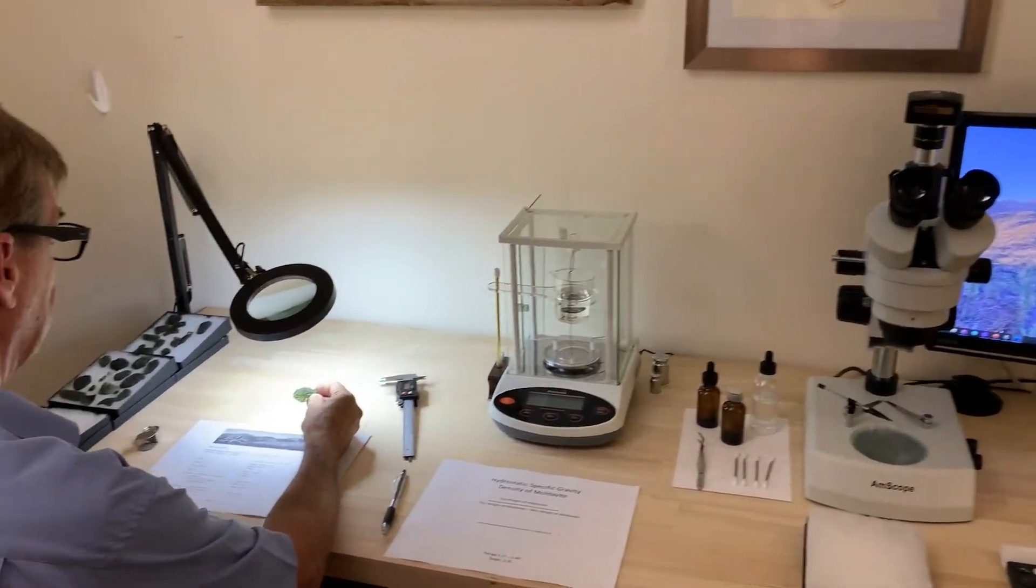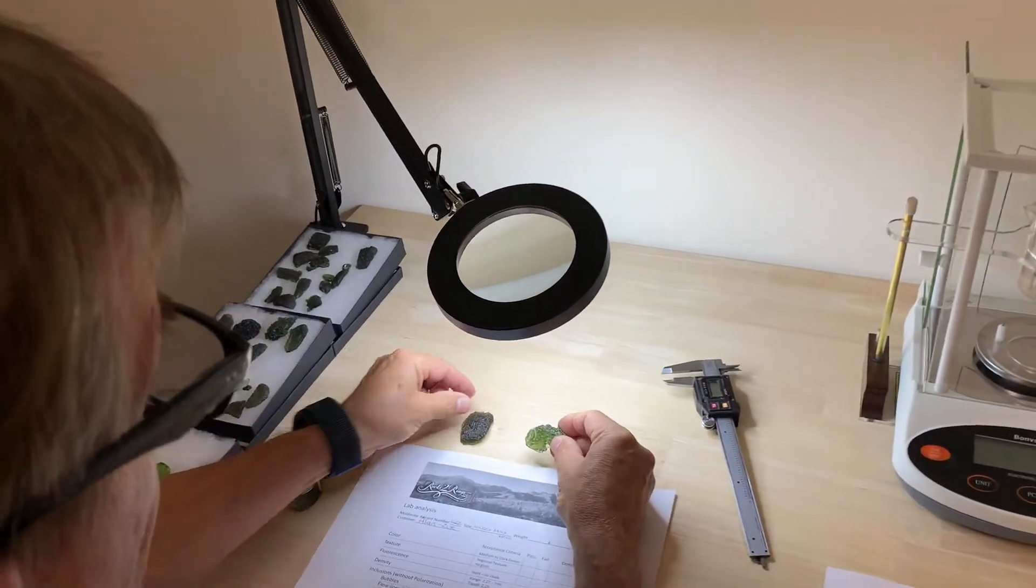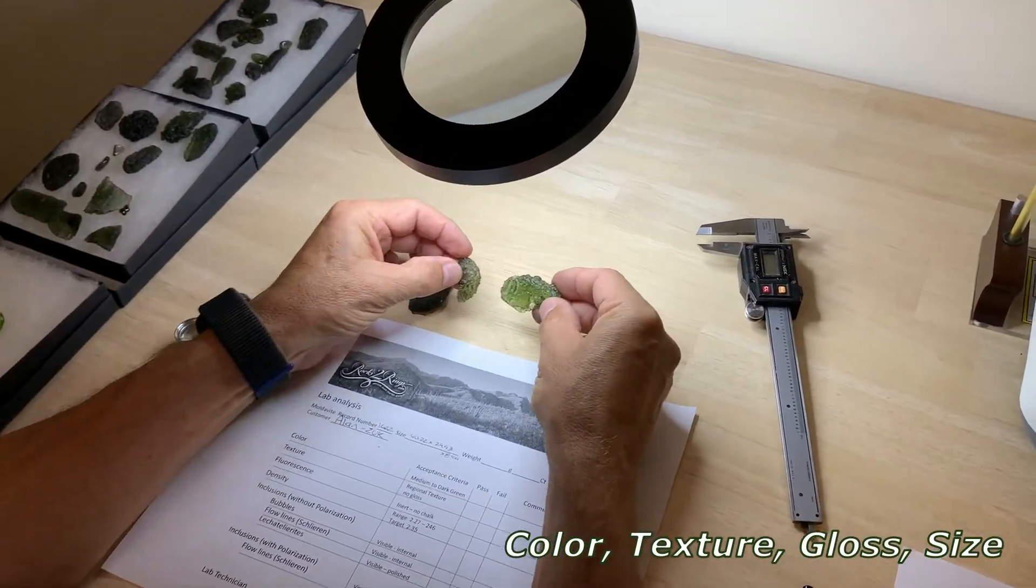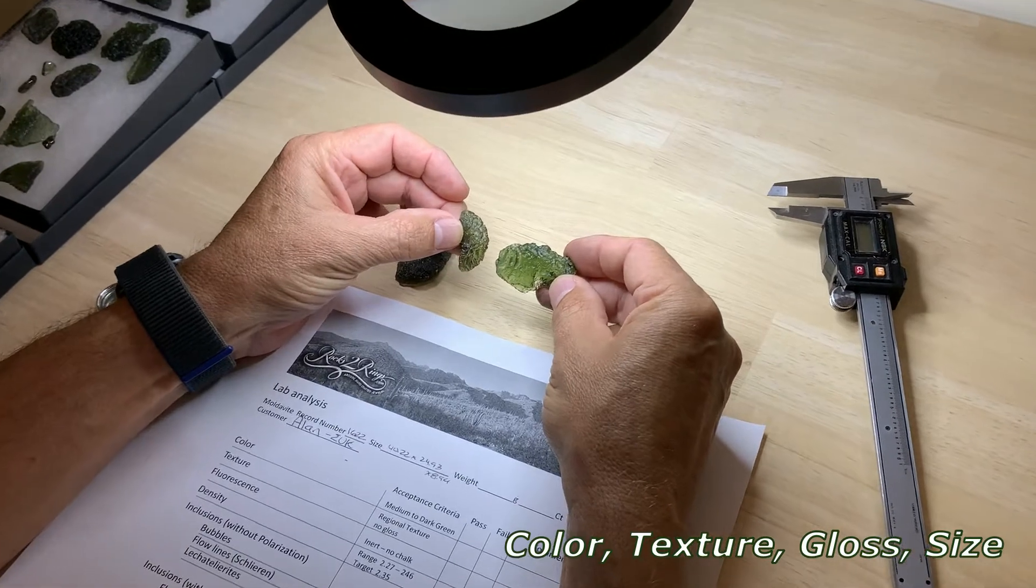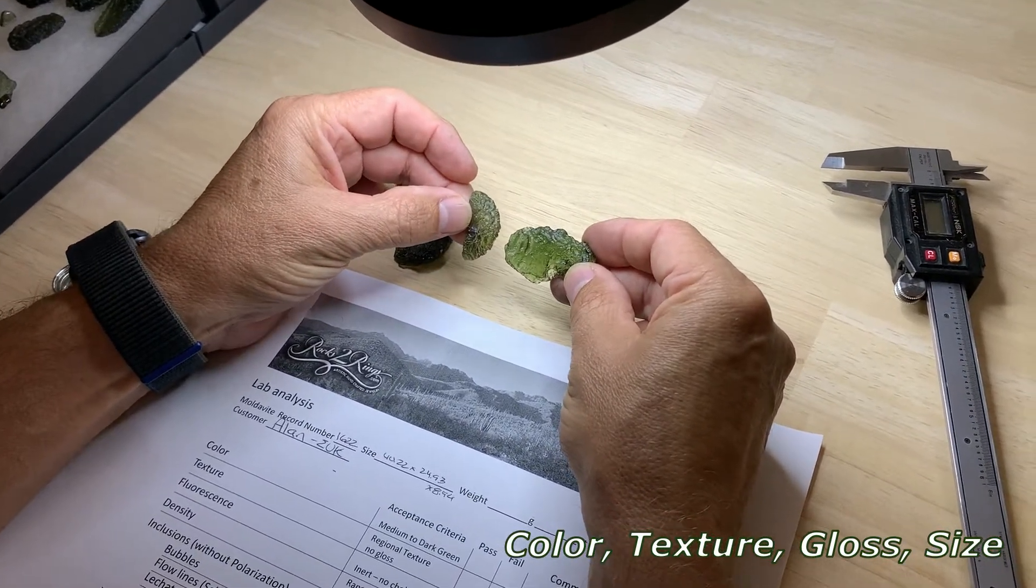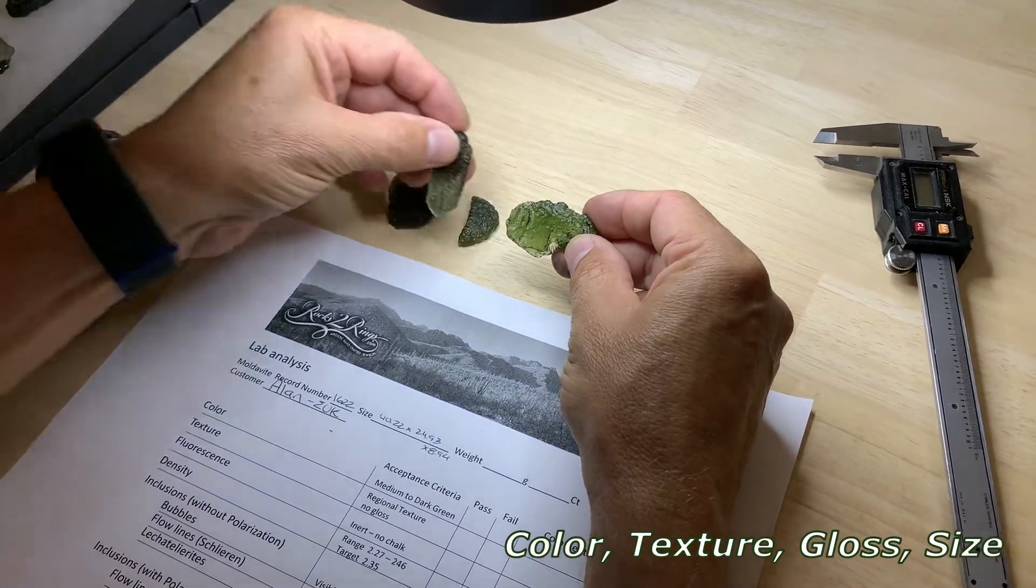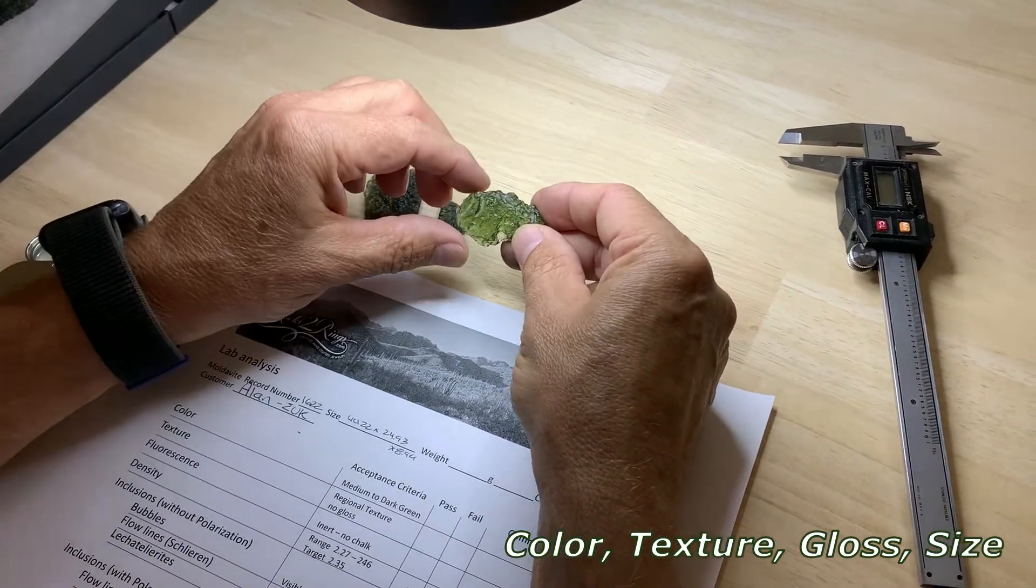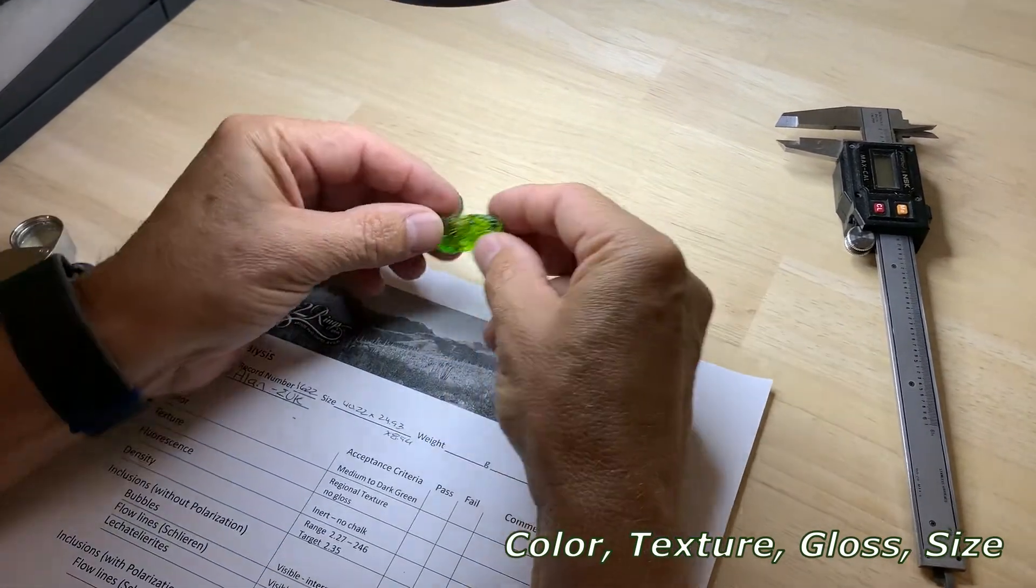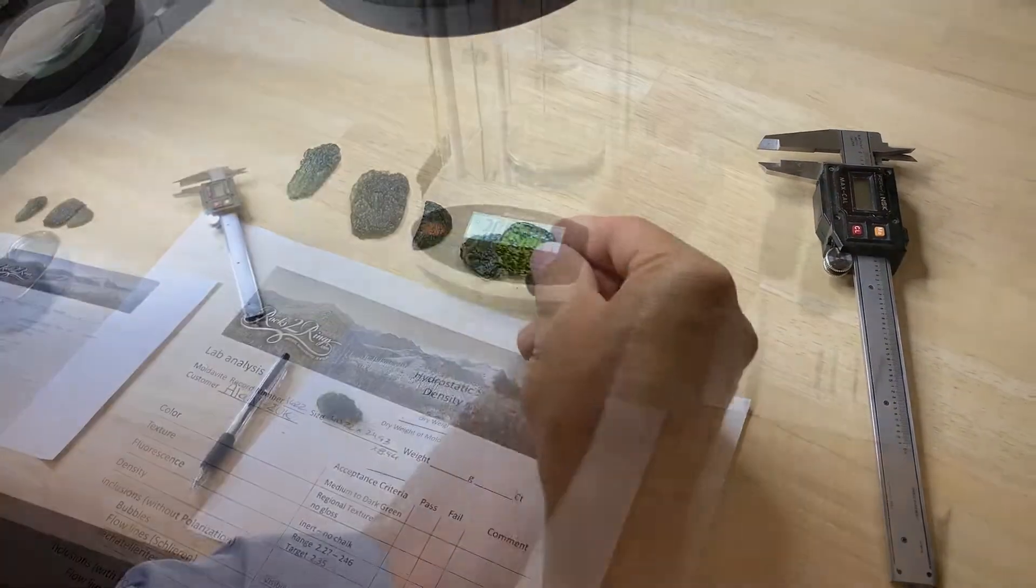The first thing we do is look at shape and texture. I take a couple of pieces from a similar mine and do a comparison. This is southern Bohemia Czech Republic texture from that field. I look at a bunch of different textures, so the texture's right, color's right. I also look at the glossiness. You can see this is a fake piece of moldavite, and this is a real one.